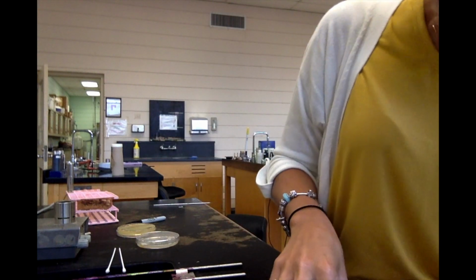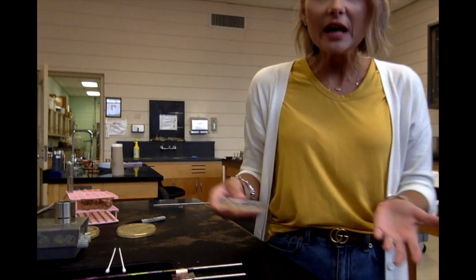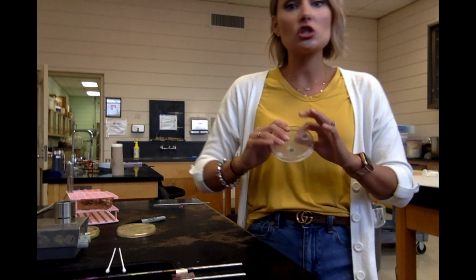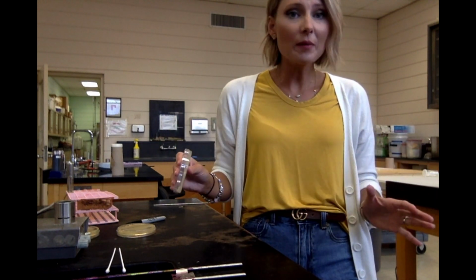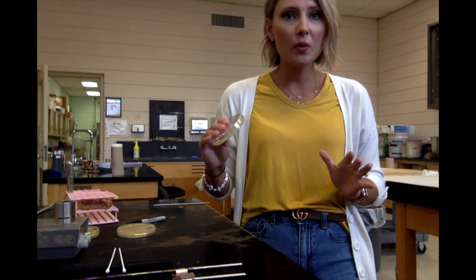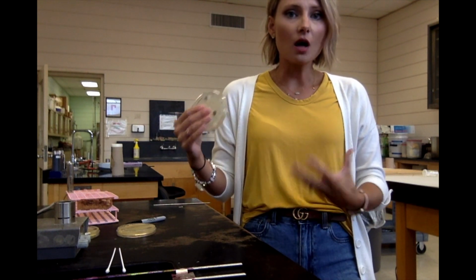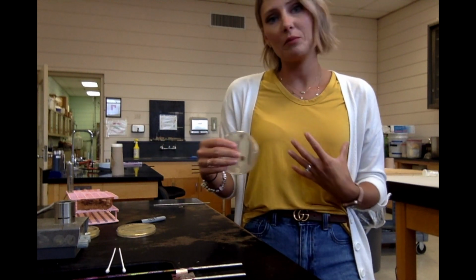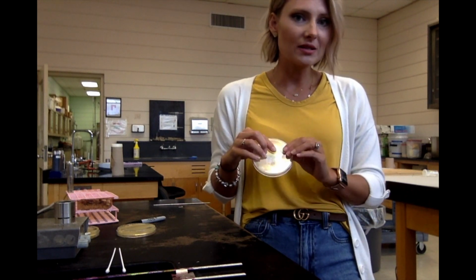Now, the PDA plate, remember, that's the one that selects for fungi. So only fungi are going to be able to grow on the PDA plate. And all I did with this plate is just open it. I didn't touch it. I didn't breathe on it. I didn't swab it with anything. All I did was open it up and let the air that's around in the lab touch the surface of the plate. I did leave it out overnight. Now, if we were in the lab, we would only leave them out for about 30 minutes or so. But I left it out overnight just so I would get some really good growth.